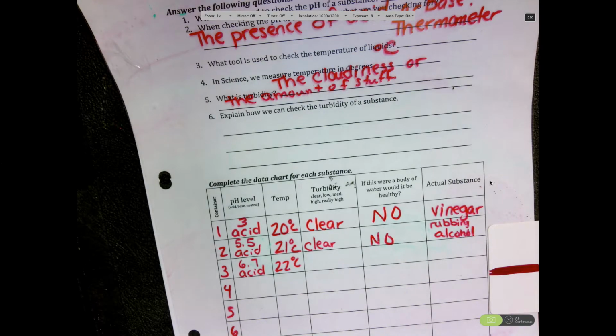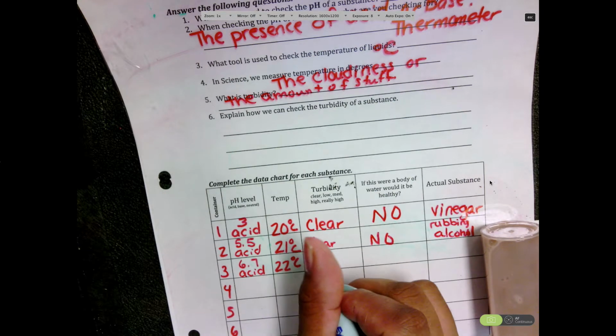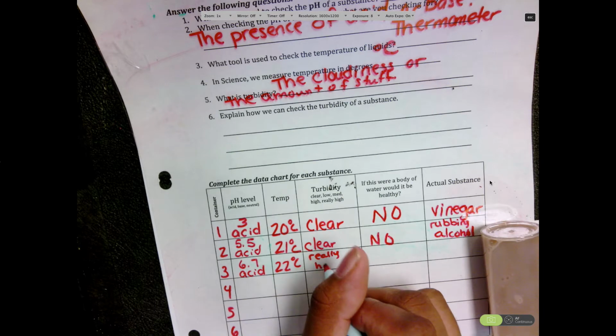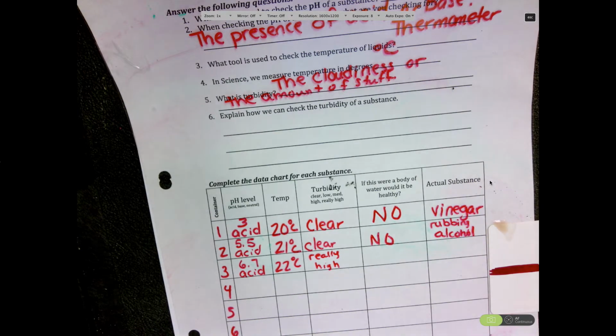All right, putting it up to the test for turbidity, really high. Did it pass the pH level? Yes, because it can be between 6.5 and 8.5. Did it pass the temperature? Yes. Did it pass turbidity? No. No, therefore it would be not healthy. And this is milk.